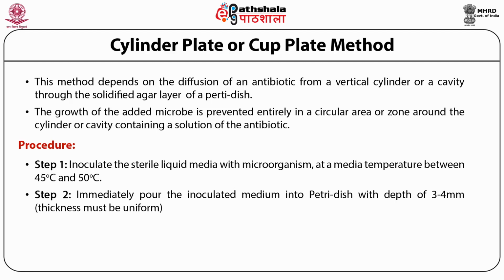There is need to pour the medium into petri dish immediately, since the media is under molten condition. If it is delayed, the media starts to solidify and it will form an uneven thickness of layer.